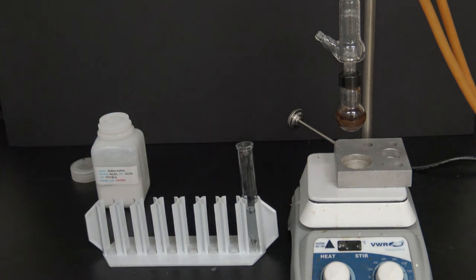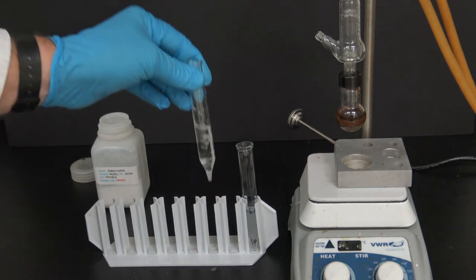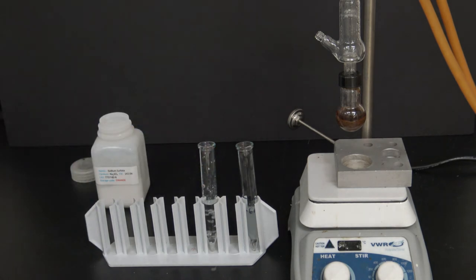And shake it up. And now when I shake it up, I know it's hard to see, but I have some that is not sticking and becoming a blob, which implies that I've removed all the water now from my product. So now what I'm going to do is transfer that material over to a pre-weighed vial.